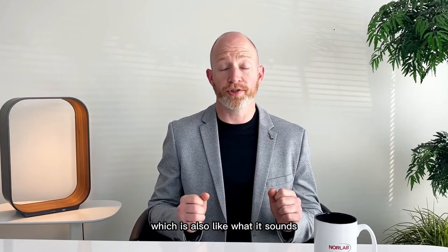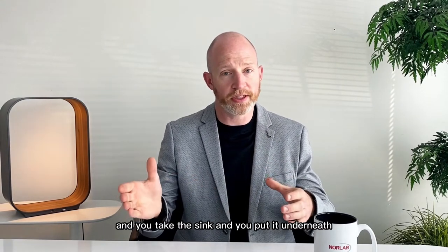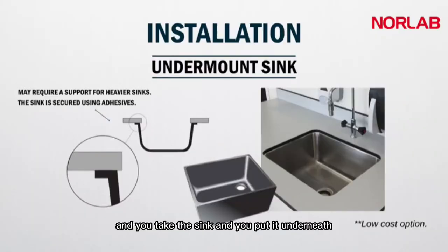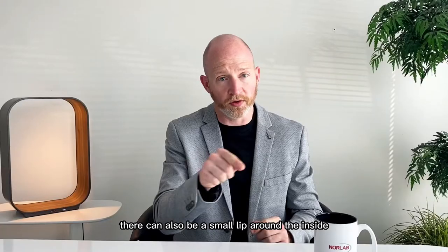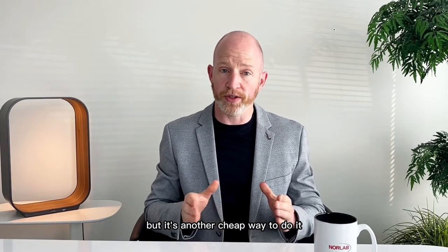Then we have undermount, which is also like what it sounds — we cut a hole in the countertop and put the sink underneath, glued to the underside of the countertop. That means your countertop edge is exposed to the sink, so the material has to be waterproof and chemical resistant, depending on what you're doing. There can also be a small lip around the inside that likes to collect gunk, but it's another cheap way to do it.